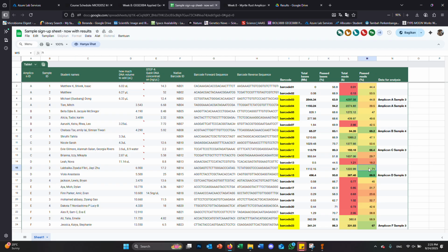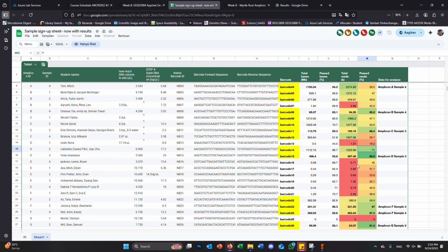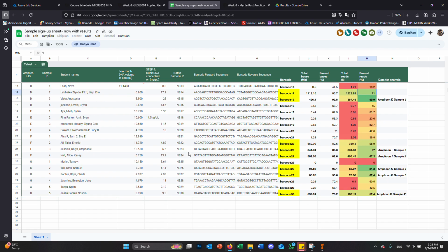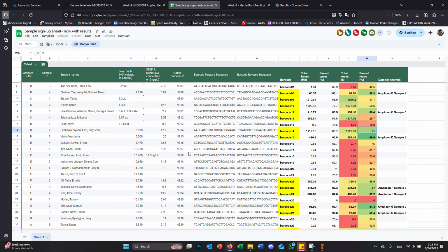So this is our nanopore sequence data. We've got reads that are up to 21,000 nucleotides, which is weird because we only put in, yeah, there should be there, but there's not many of those reads among them. Most of the data would be around this length here, so sort of maxed out at around 2 kb.